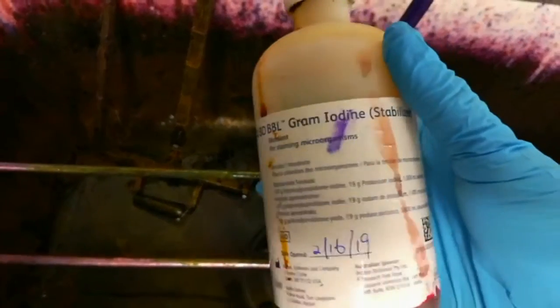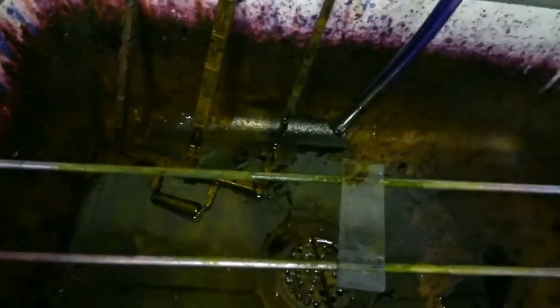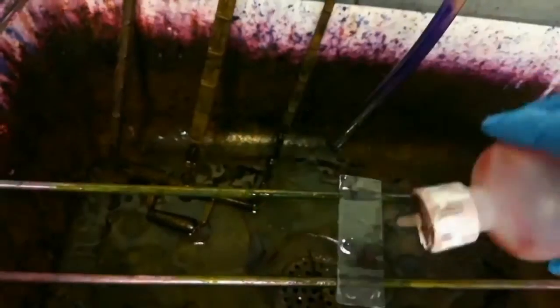Staphylococcus species identification method. This method is to separate the species into Staph aureus or coagulase-negative Staph. First step is to perform a Gram stain, second is to perform a catalase test, followed by a coagulase test. Gram stain for Staphylococcus species is always gram-positive cocci in clusters.